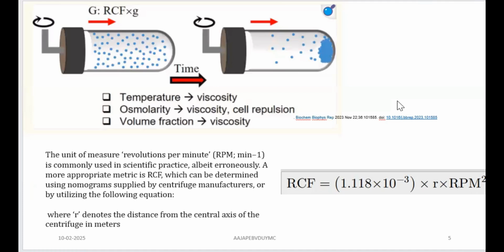Can you just draw the diagram, the central shaft, and from the central shaft, you draw the outer margin that shows the rotor design and the tube in it, right? Schematically represented. Or you can just imagine the picture of the centrifugation process, right? So R is the distance of the particle in the sample holder from the rotor axis.